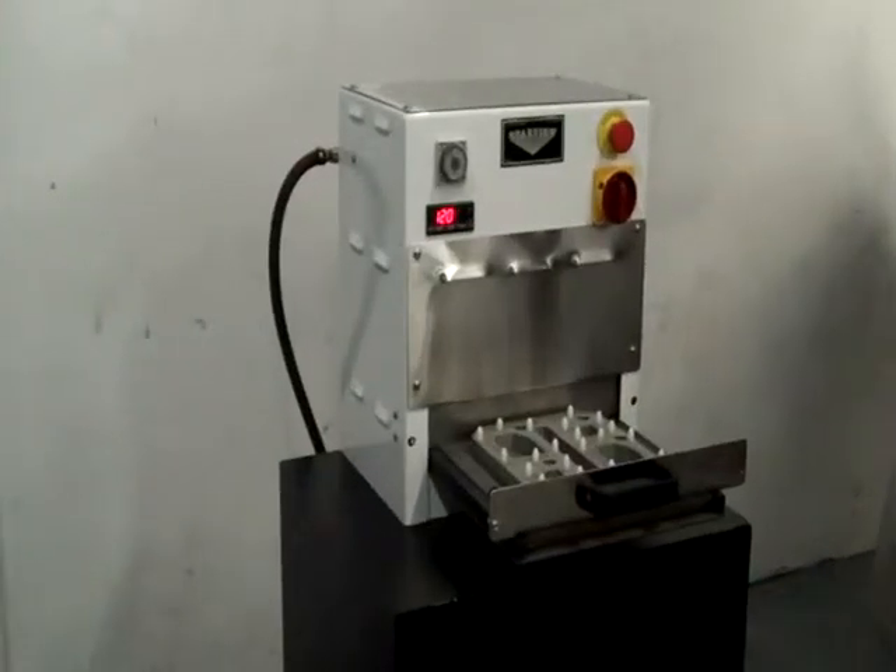Starview's SB-PH1 series single-station tabletop manual shuttle heat sealers are designed for product development and small-volume production requirements. The compact size allows this series to fit into most laminar flow hoods or clean rooms with limited space.